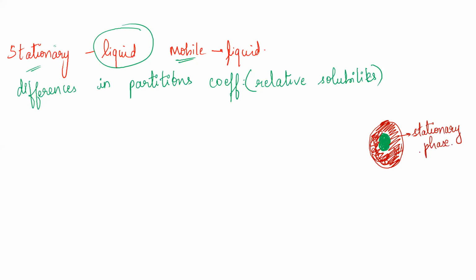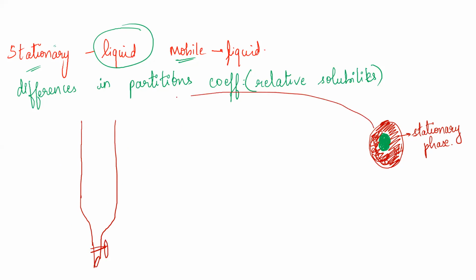So now where do you place it basically? We are talking about column chromatography. The column basically looks like this. Have you all seen burettes during your chemistry practical in class 12? Yes, ma'am. So the burettes are like this. We are going to use something which is very similar. This is the column. So you're going to pack these stationary phases.